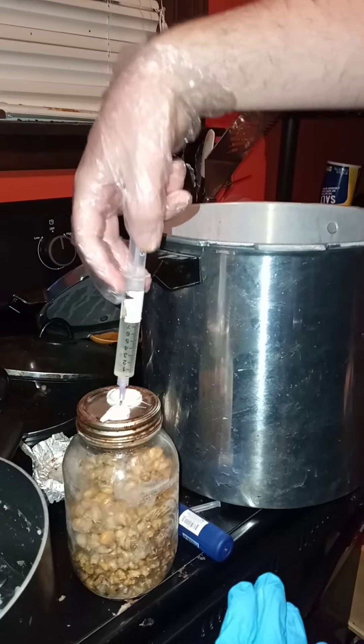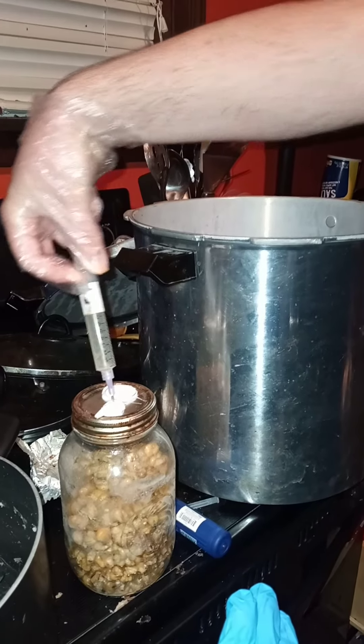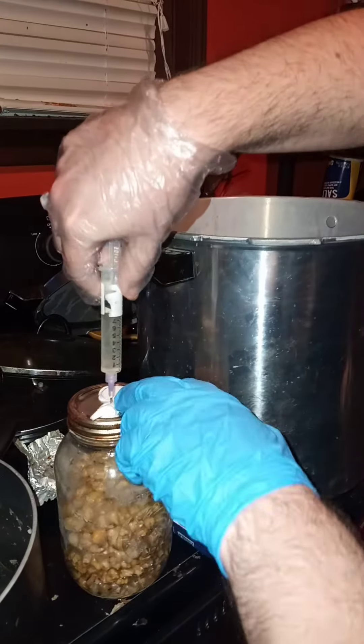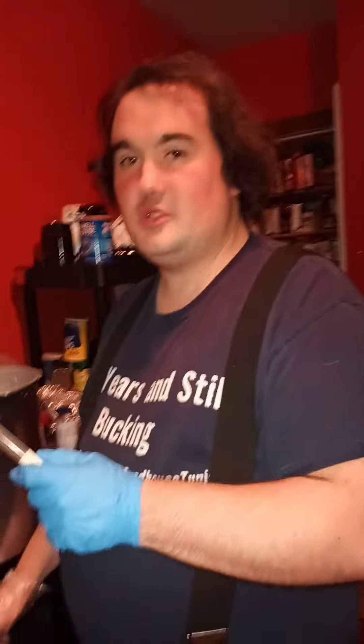Then all you do is inject about a milliliter, maybe two, and that's all you have to do. Have a good day.